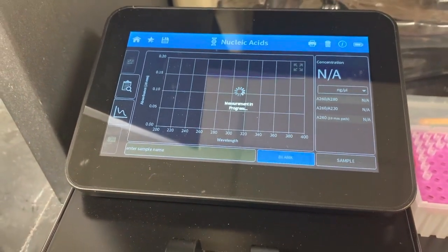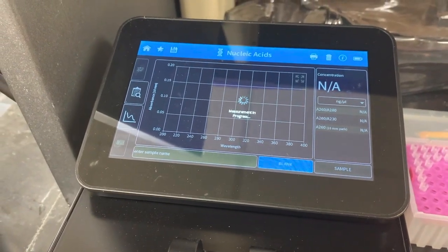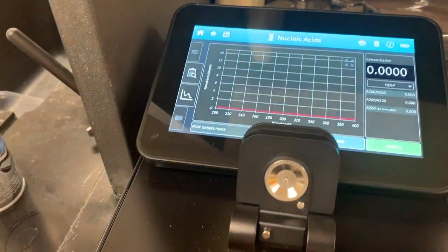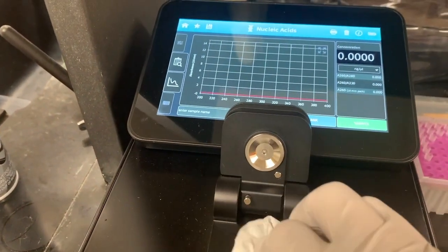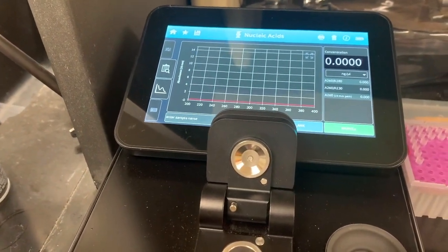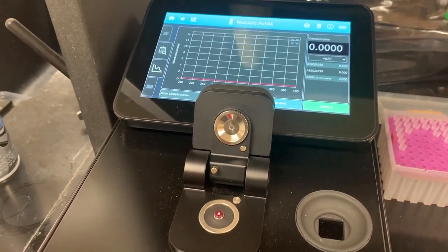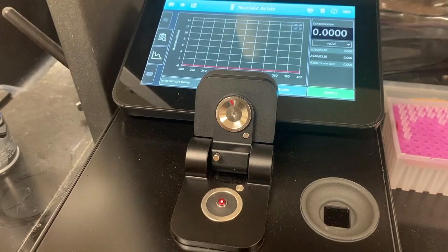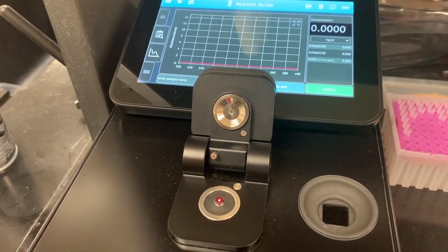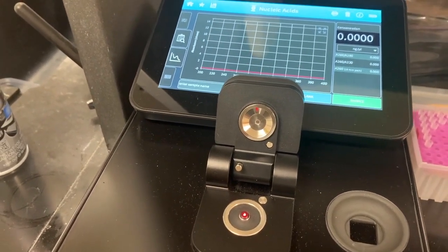And the machine will just send light through that solution and normalize, so that whenever you have your nucleic acid sample, it will subtract out any absorbance that was present in your blank solution. I'm using elution buffer because that's what my mini prep samples are in, but if you had your samples in water, you would use water for this. And I always use the same water, so you don't want to use RNase-free water to elute something and then take some sterile water or water out of the sink to do your blank, because those would be different.